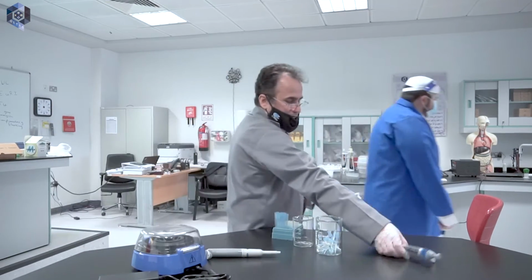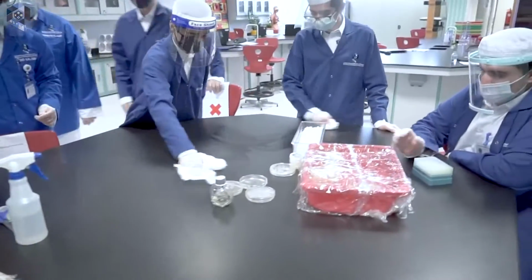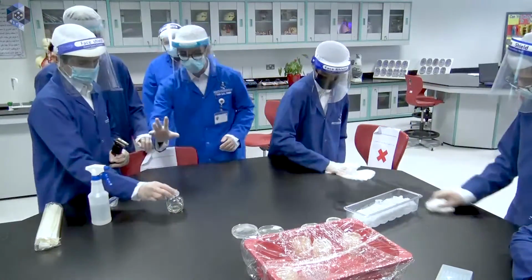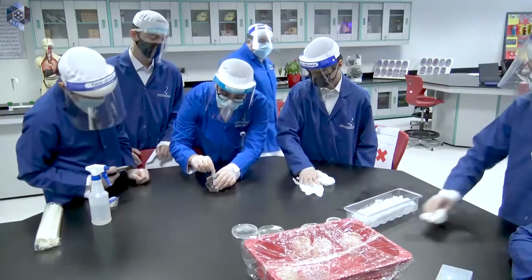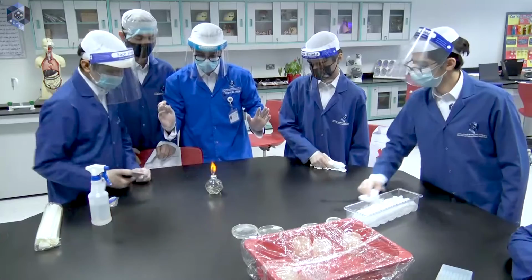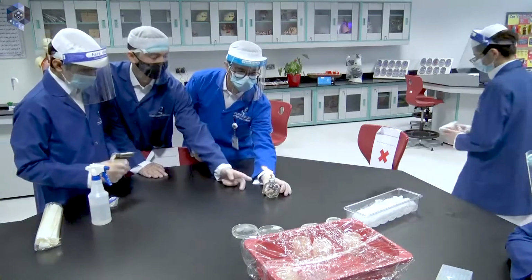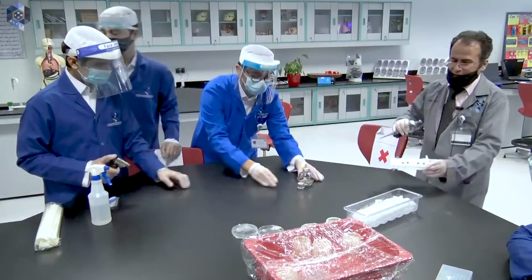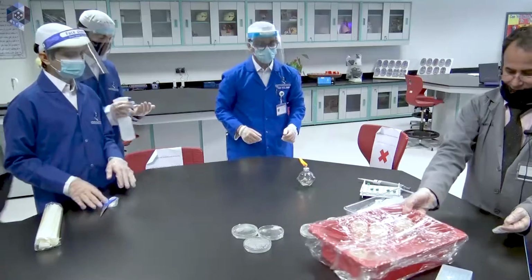Now, we will plate 100 microliters from these into the Kanamycin plates. I asked one of you to get them ready.